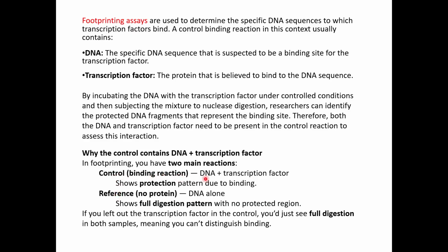In your control reaction, you have your DNA and transcription factor, which shows the protection pattern due to binding. Then, in case of your reference, there is no protein, DNA alone. This shows a full digestion pattern with no protected region. When your protein is not bound to your DNA, after using your nuclease digestion, all the regions will be cleaved at all possible sites. So, you will have a fully digested pattern.